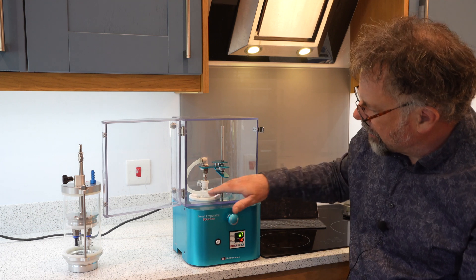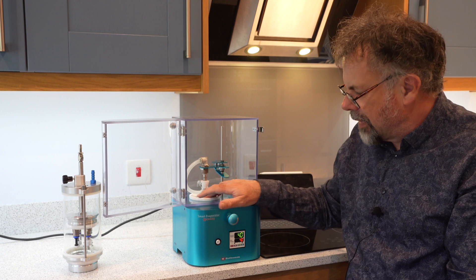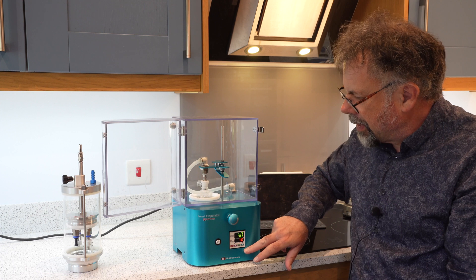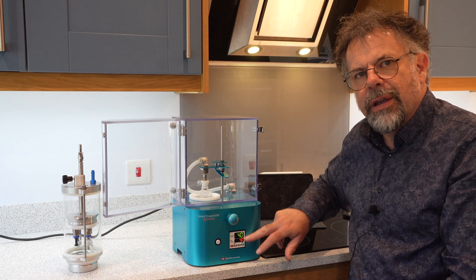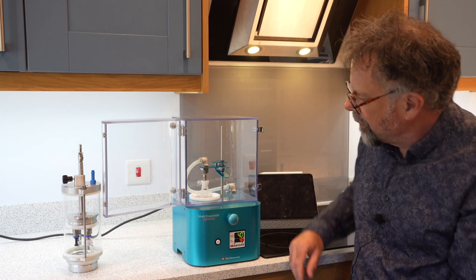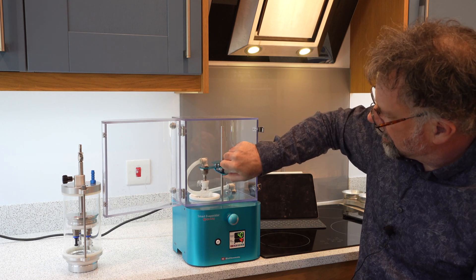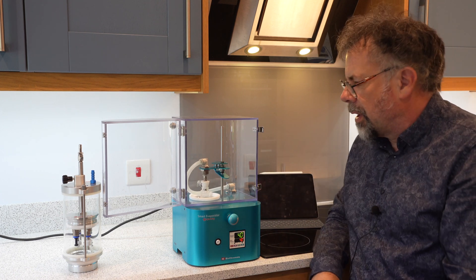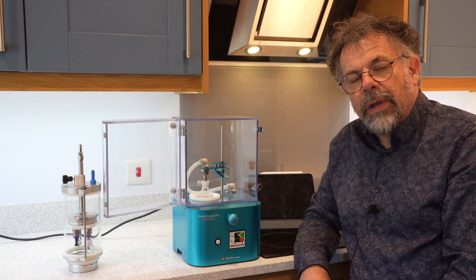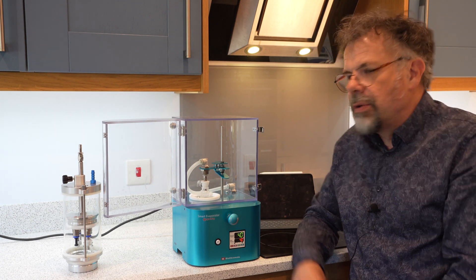Inside we have a small heating chamber full of aluminium beads for heat transfer, so it will fit any size of tube. Temperature control is on the front — currently set to 40 degrees centigrade, but you can set that up to 70 degrees centigrade. We also have a simple holder for the plug to drop in and a sealed chamber so we can control the atmosphere — for instance, an inert atmosphere if needed.